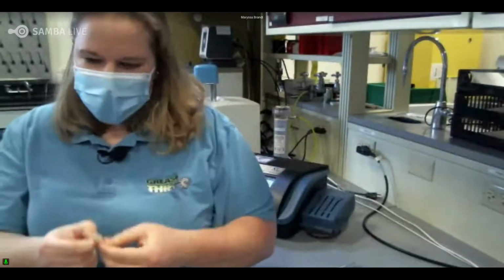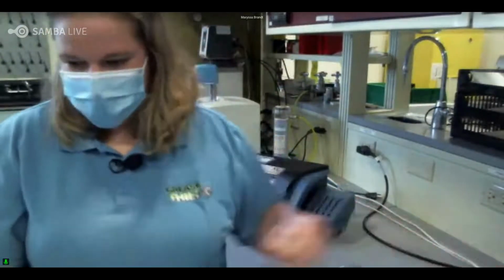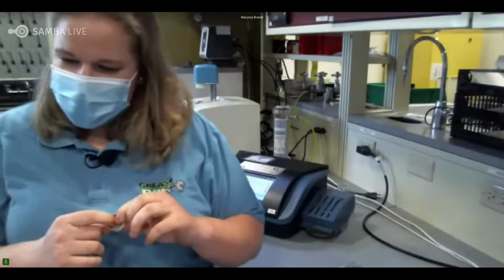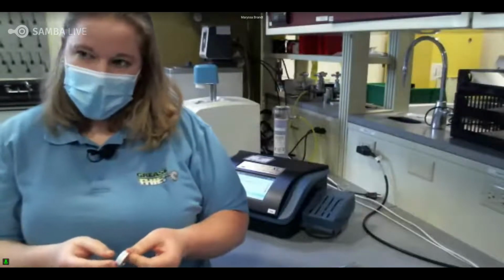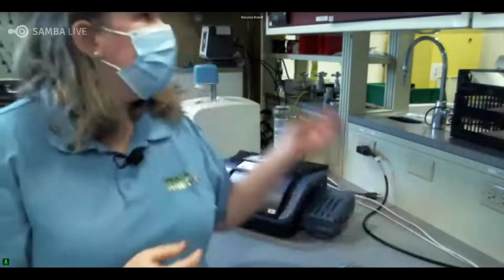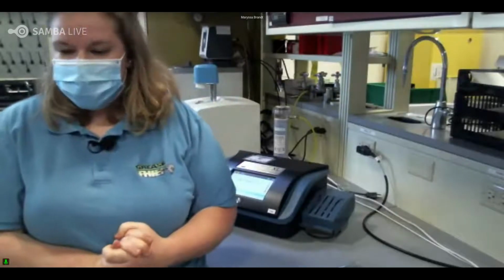And as long as you are able not to see through them, as long as you're able to still have a good seal on them, they are still able to be used. So you do not have to change your septums every time. Like you have to clean them, but you do not have to buy new ones every time. They are able to be reused as long as they are clean and dried. Same with caps are able to be reused, and even our moisture vials themselves, you do not have to throw away that glassware. You can simply clean them and dry them, and you're able to reuse them as well.